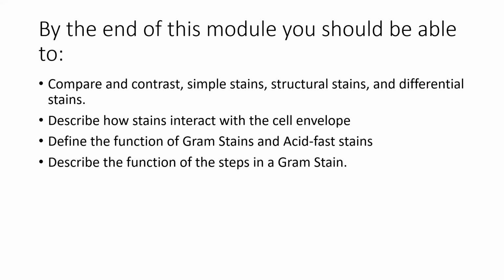By the end of this module, you should be able to compare and contrast simple, structural, and differential stains, describe how stains interact with the cell envelope, define the function of the gram stain and the acid-fast stain, and describe the function of the steps in a gram stain. So, going a little bit deeper with the gram stain.